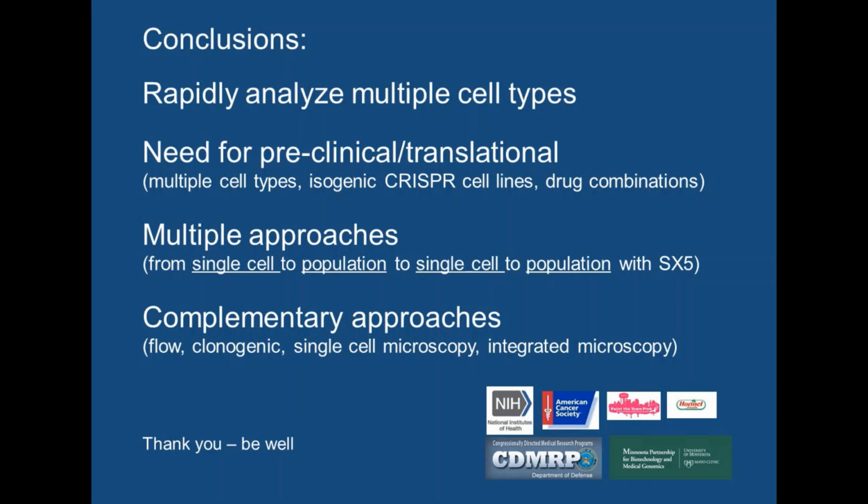We then go to this population instrument that allows us to look at a large number of cells and say, here's the drug, here's the pathway. Initially, we would bring this back to the single cell level to continue to refine our model and make new predictions.